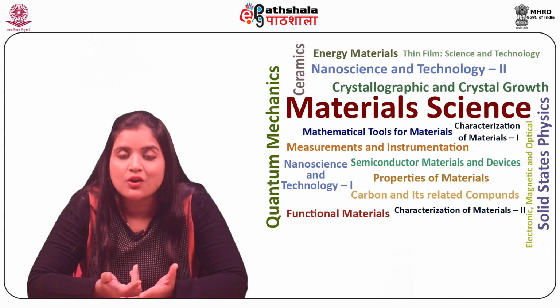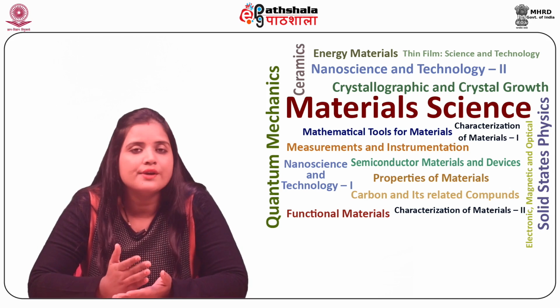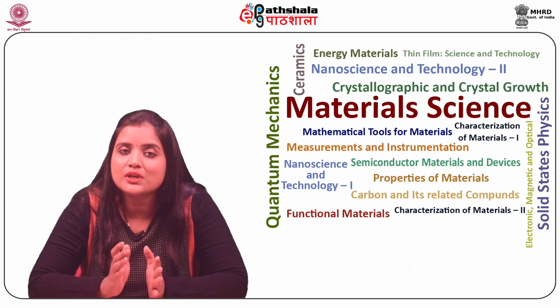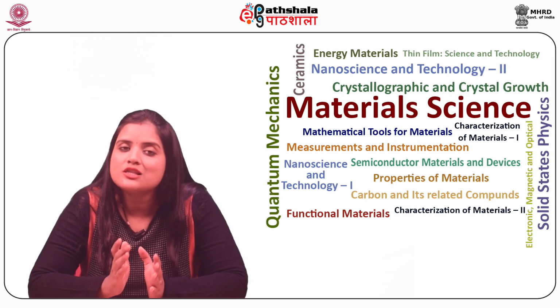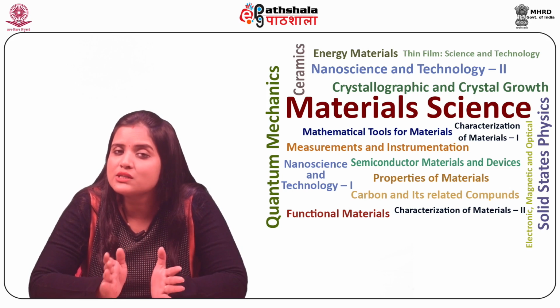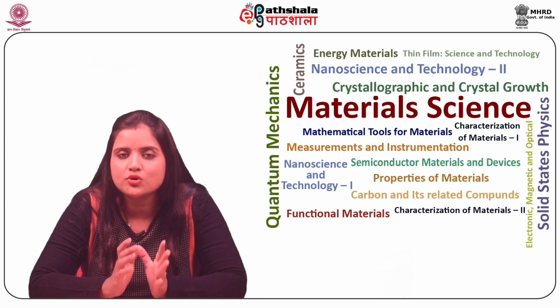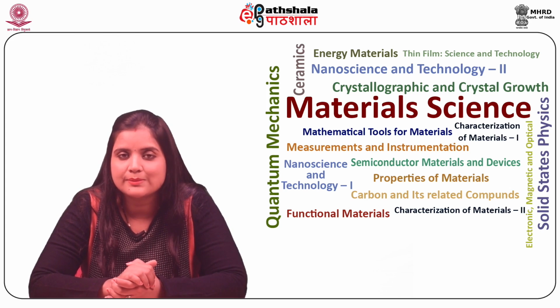3D particle tracking forms one of the quite useful applications of DHM. A Z-stack of measurements can be reconstructed digitally from a single hologram using a range of propagation distances. For each particle, specific algorithms facilitate determination of the distance corresponding to its best focus. This operation on a time sequence of holograms allows determining the trajectory of particles.